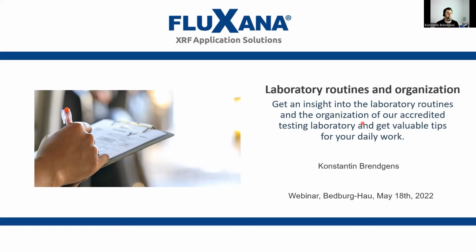And the question here is, how do I make sure that my analyses are correct? What can I, in terms of organization, develop as routines and habits to make sure that I can always trust my analysis and be confident with what I report on the samples that I analyze?